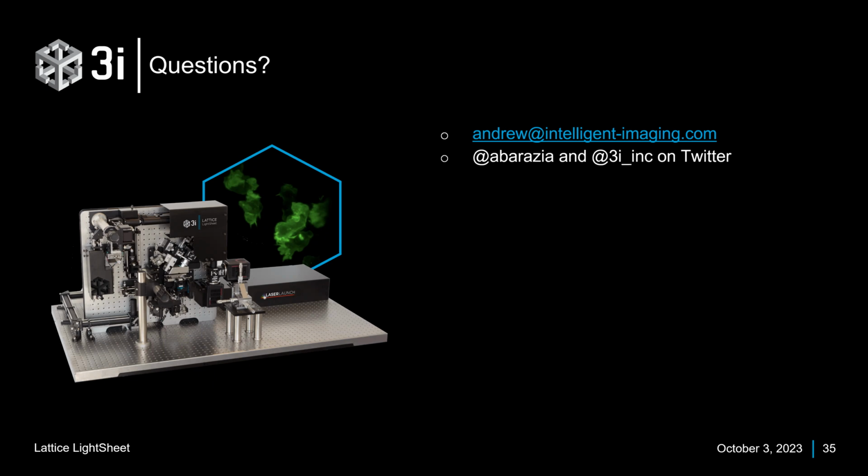A lot of groups have moved to Halo and Snap Tag labeling with the Janelia fluors. It is wonderful on the system. It lets you do some single molecule imaging if you want, but it also just gives you really nice labeling. They're really photostable. I mean, they're the next generation of probes, and Janelia also gives them away for free if you ask them nicely. I think we had some that we use on our Lattice set. We have some live dyes that would be really nice.